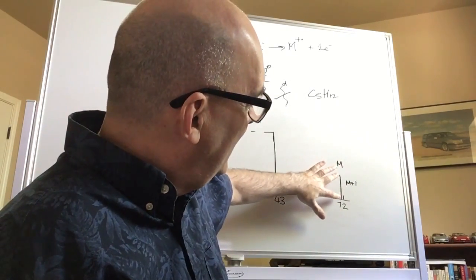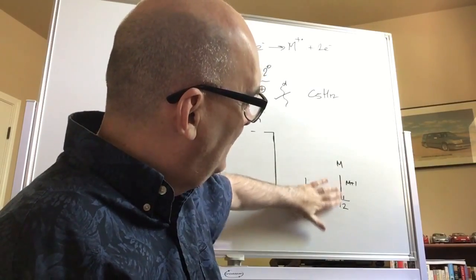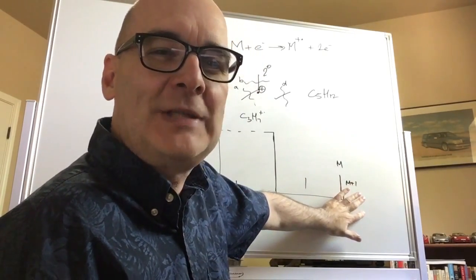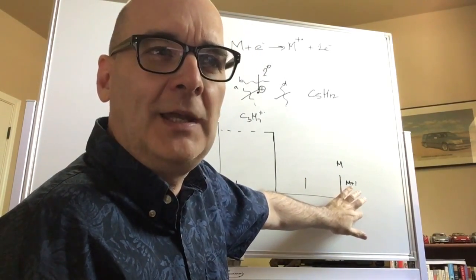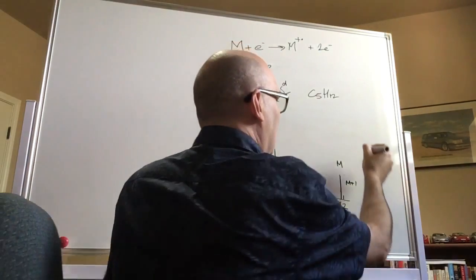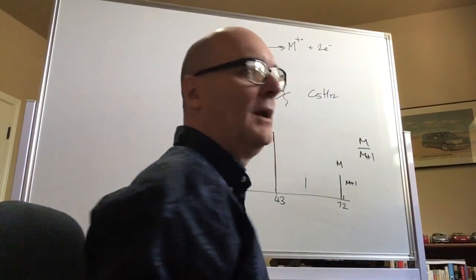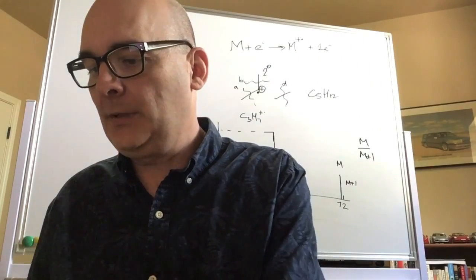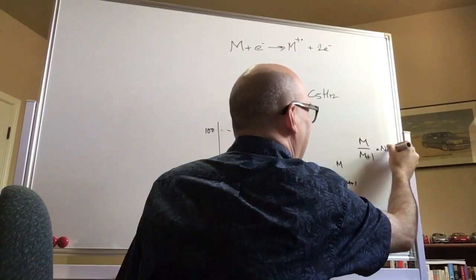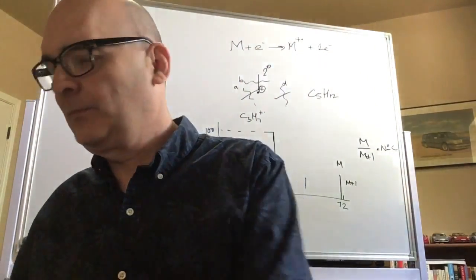So anything that's included in M that is not carbons will not be represented in this other peak. So if I take the ratio of M over M plus 1, that can lead me to the number of carbons in my actual sample. Okay.